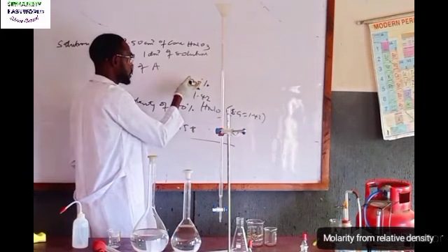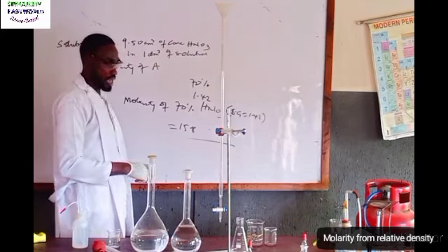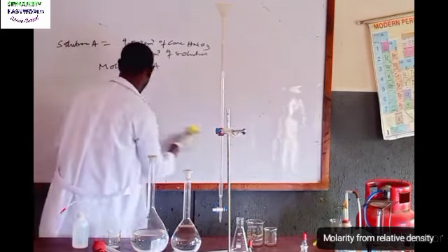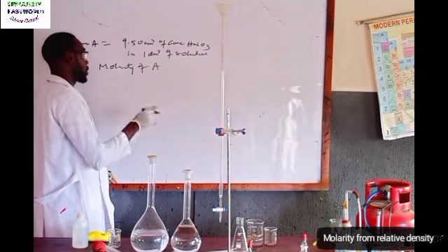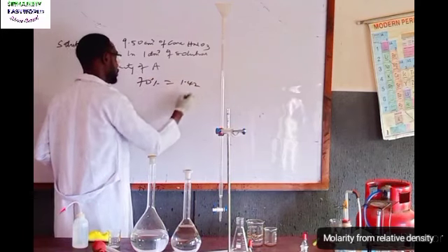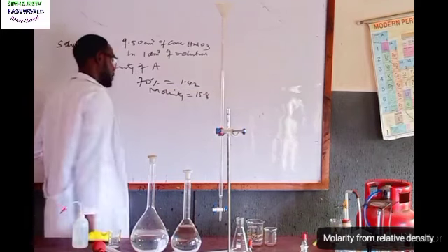As far as the percentage is this and the SG is this, you can discover SG by yourself, like I told you. You check the video here, you know how to know the SG of the solution. So I'll just say what is needed: for HNO3 of 70% and 1.42 SG, because all the 70% concentration of HNO3 have SG of 1.42, and the molarity, I repeat, molarity is 15.8. That's what I'll be using here.